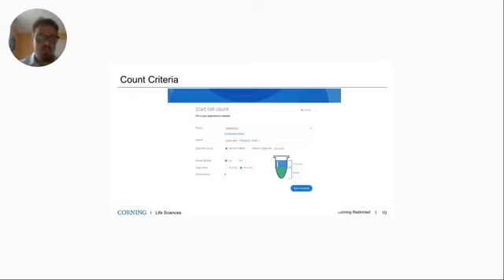And, as we keep updating the algorithm, most users want to keep using the algorithm that they have used. So as we update it, if you're a new buyer, you're always going to want to use the newest version. However, if you're comfortable with an older version, feel free to use that version. So we have this listed here. Version 2 is the original. Version 3 is the new. And if there's ever any question on which one you should use, you can always contact us or hit this more info button. And this more info button is going to take you through what version of the software you should be using.